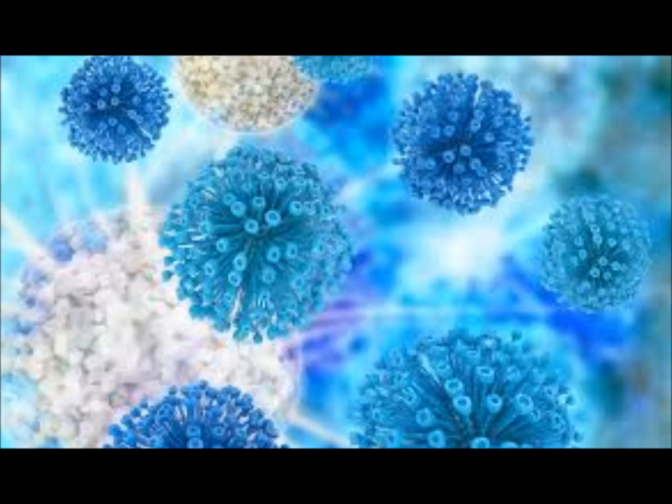And why did you need, and I shouldn't have circled all the media, she only circled what is special media. So why did you need the CNA media circled on the back side? Because it can look like blood, and you want to make sure you're working from the right plate. You only want to see growth, no growth on the CNA, because it's selective for what? CNA grows only the gram positives. MacConkey's grows only the gram negatives. So the CNA looks like a blood plate, so you don't want to pick up and work from the wrong plate.